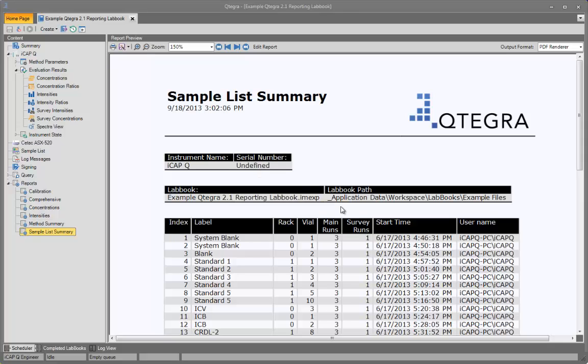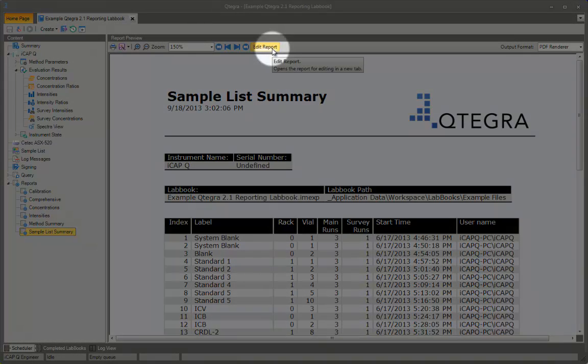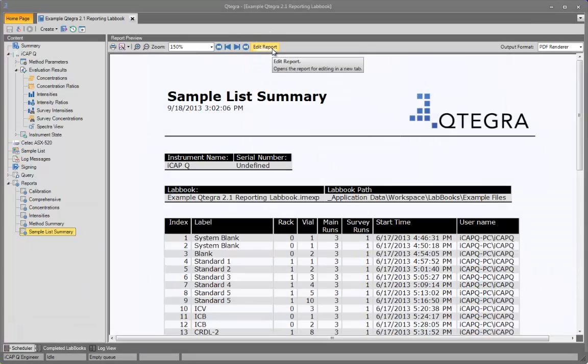If the report format is not suitable, it can be edited in the supplied report editor, which can be opened from the Edit Report button here. Use of the report editor is covered in a separate video.